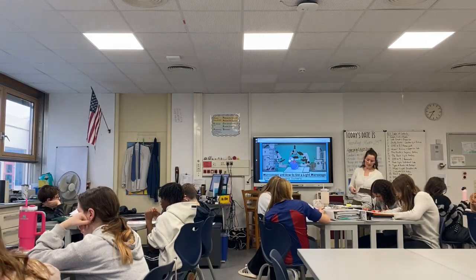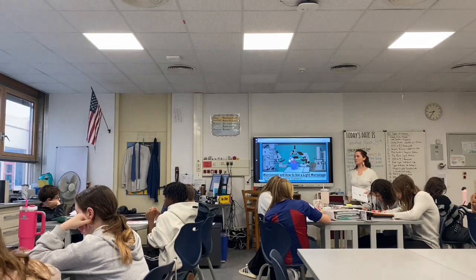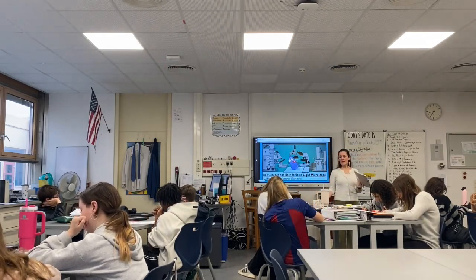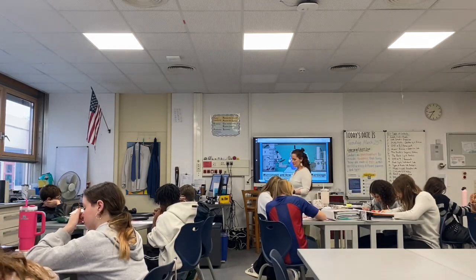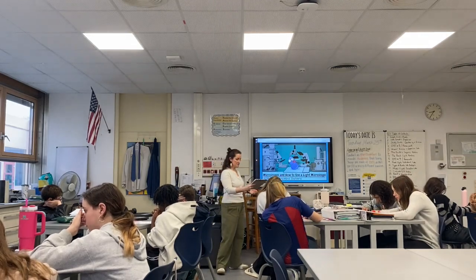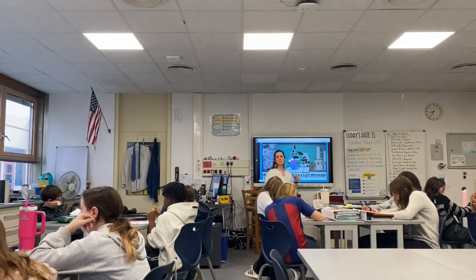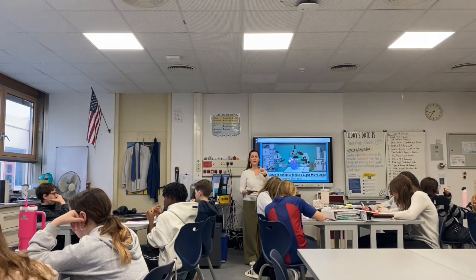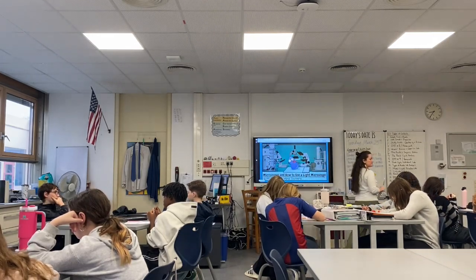Okay? For the tips, why is it important to remember that the slides and cover slips are made of glass? Yeah, they can break easily, definitely. And as we go to the next two tips, we're going to see why that's important too. So when using a light microscope, why is it important to use the scanning objective first, before you go all the way to 400x?